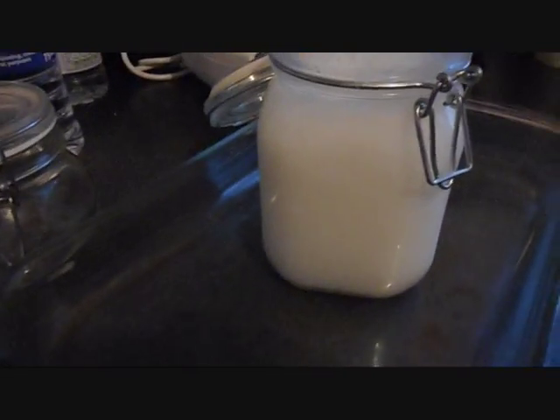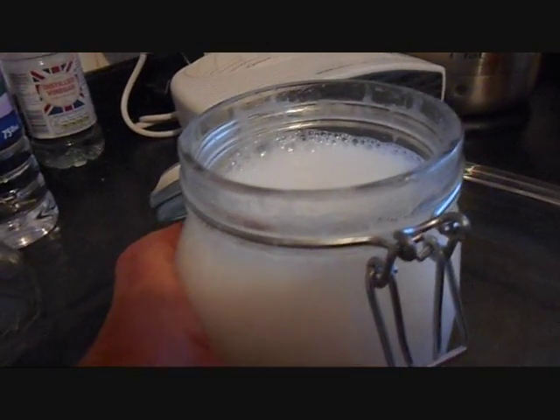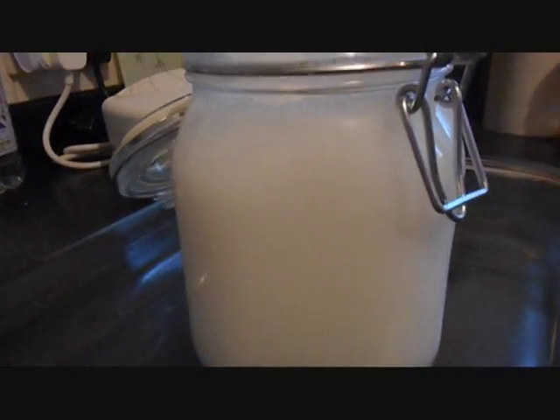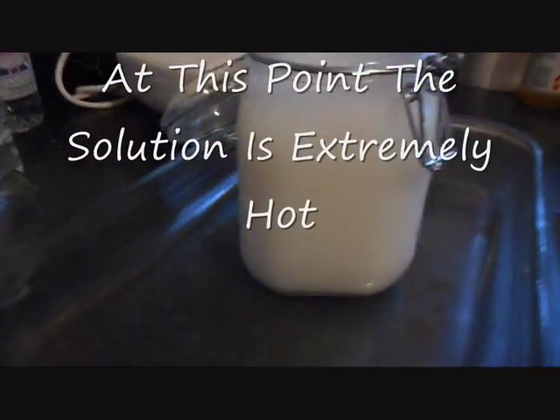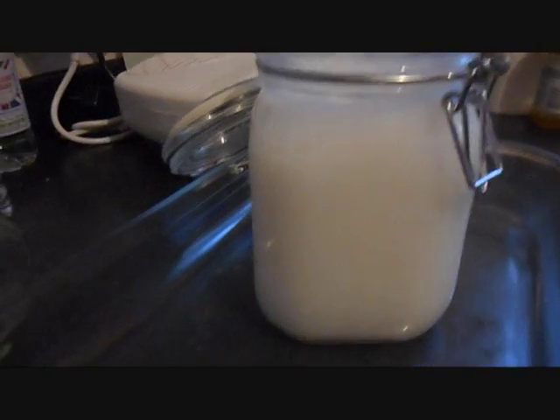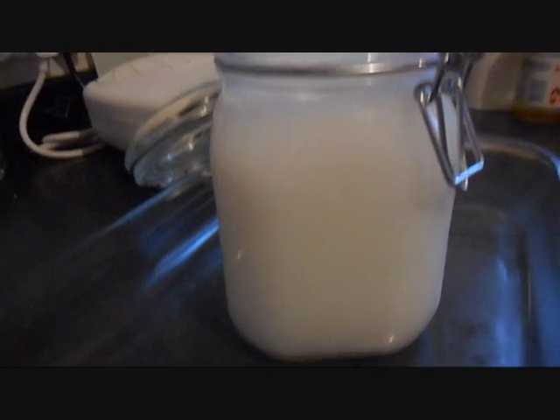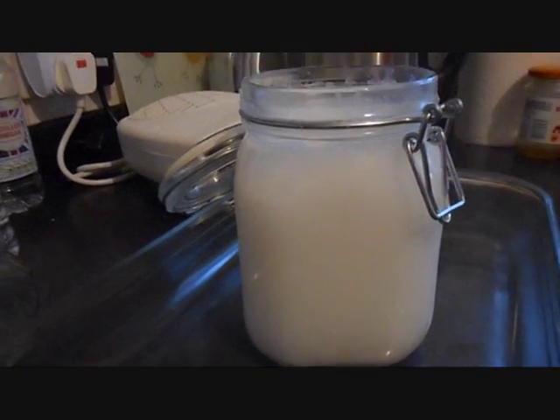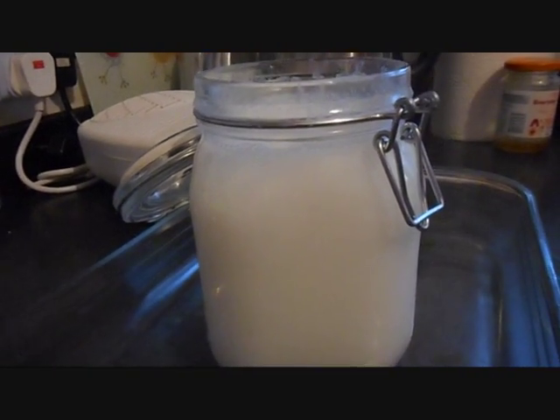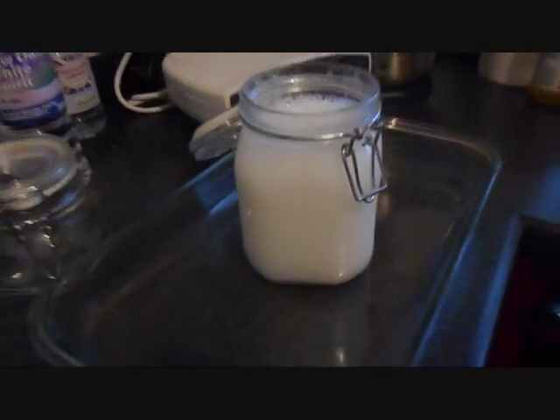Well, I had a monstrous time trying to get that to mix in with this. It just didn't want to dissolve. I think the salt content must be just massively high. So it turned into this milky mess, which I wasn't expecting. So now I've got to leave this for an hour, and then we'll try and do an extraction off of it. We'll add some of the white spirit and see where it goes. So I'll be back in an hour.